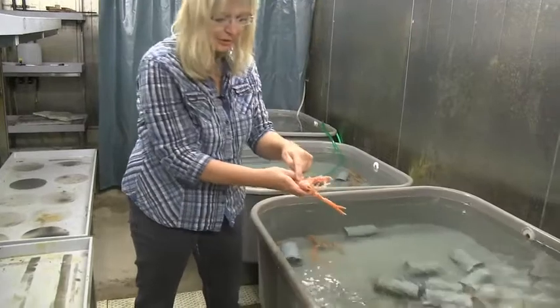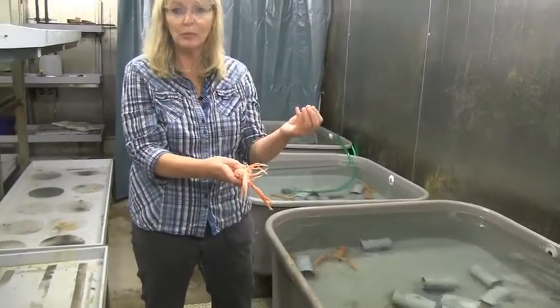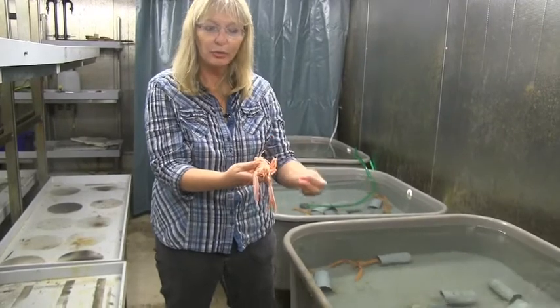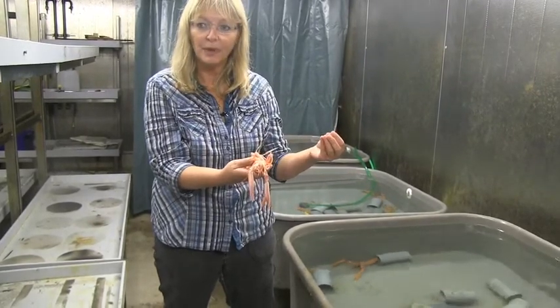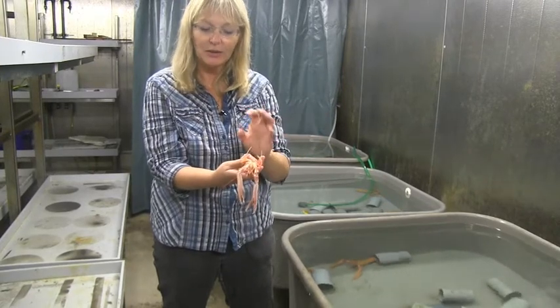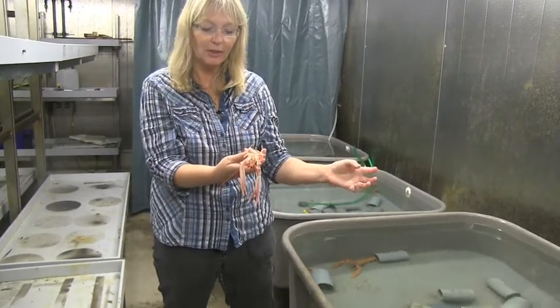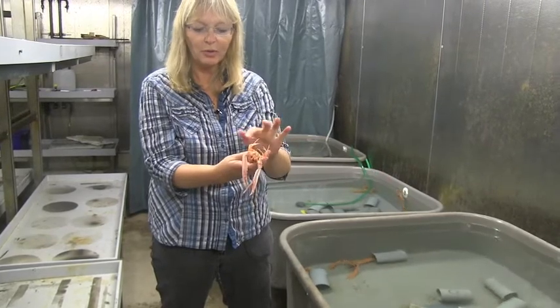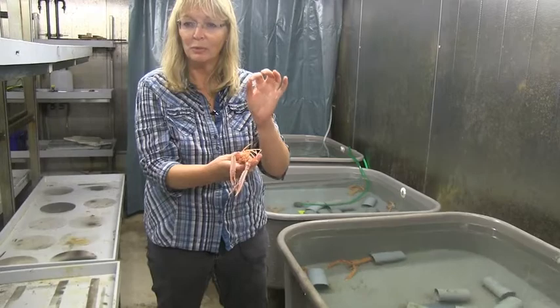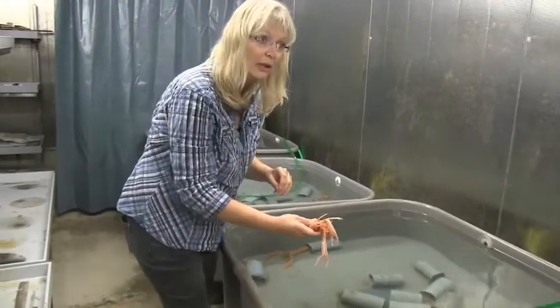We have the gills underneath here, and that's filled with water. When you pump it up with air, it's going to lose some of that water. If you don't make sure that that cavity is filled with water, they will put back in the water so those air bubbles come out. Then the gills will stick together, and it will be hard for the animal to breathe.